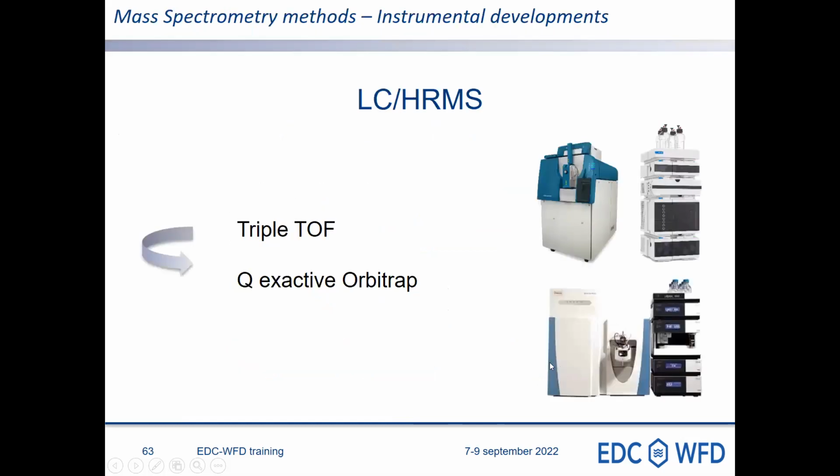This is the key message for LC-MS/MS. In the project, we have also investigated the potential of high-resolution mass spectrometry with respect to the quantification of estrogens. We investigated both technologies, both TOF and Q-Exactive Orbitrap approaches.